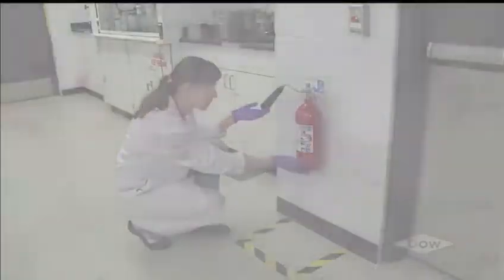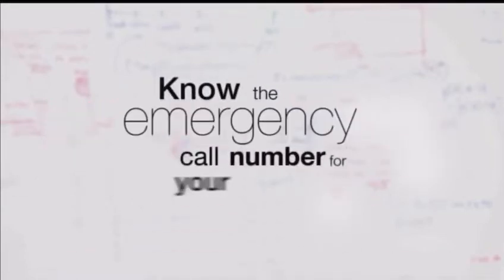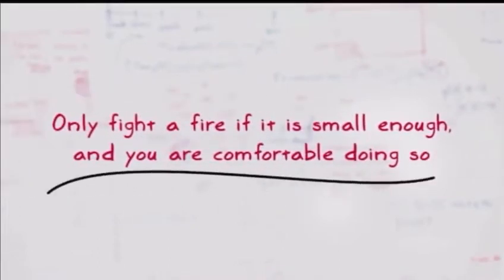Before we go any further, firefighters are trained to handle fires. Always let the professionals handle fighting a fire. Your personal safety is of utmost importance. Before you start to put out a fire of any size, assess the risk. Follow the emergency plan for your lab facility. Know the proper way to report fires for your work area.